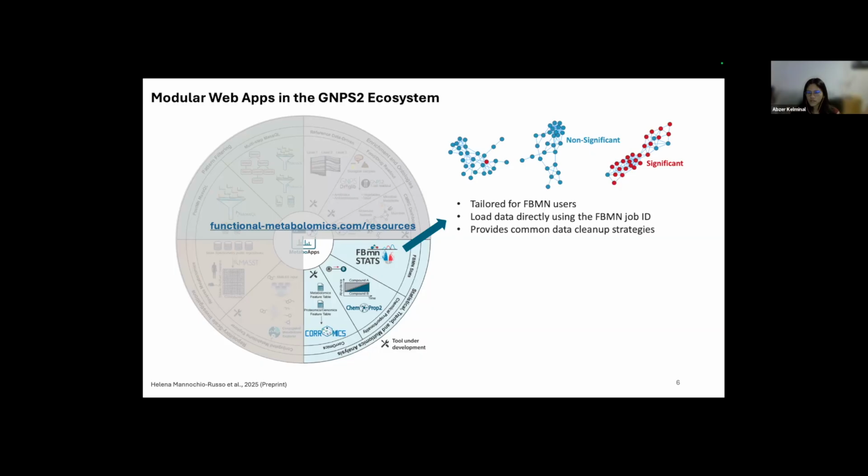This is just a hypothesis. The hypothetical example that I'm showing here is that molecular networking already gives us these nice clusters when we do not have great annotation. Then we could already contextualize with the chemical classes or molecular family, saying that there's a carbohydrates group, alkaloids group, so and so. But with the stat information added to the molecular network, for example, here we could ask further questions like, why is this particular feature significant when all the other things are not significant? And what is the fold change? And it just helps us to understand the data better.